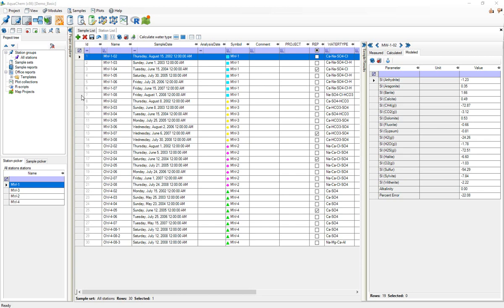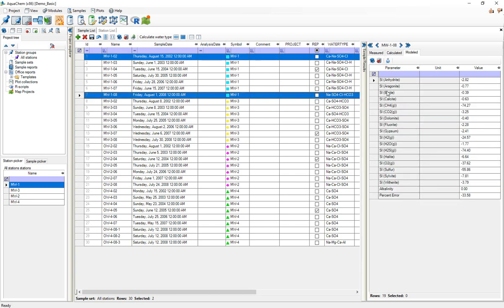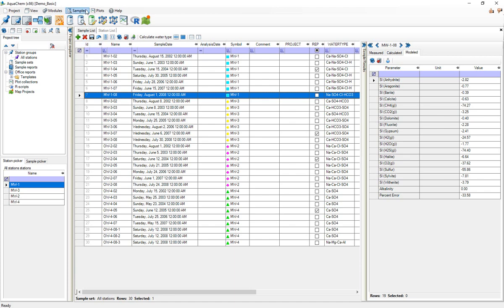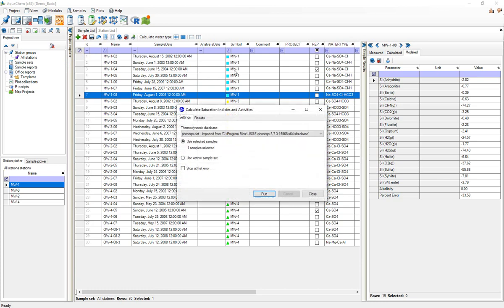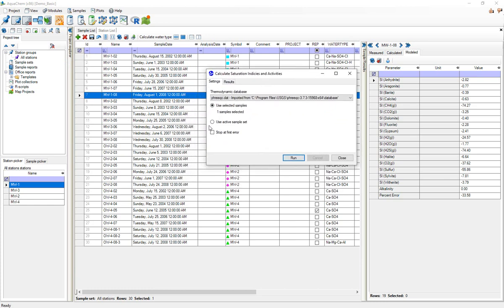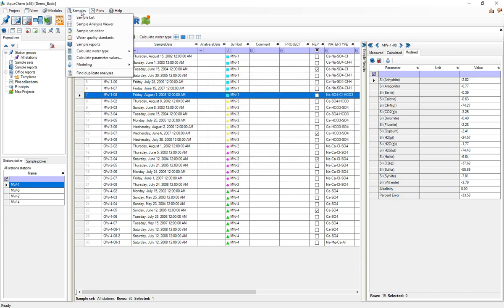There's a couple other functionalities. I just showed the one button calculation saturation indices, but if I want to do that for multiple samples at once I could do that by selecting samples, modeling, calculate saturation indices and activities, which would open this window where I could either do this for the selected samples or use it for some sample set. So if I wanted to calculate all the saturation activities or saturation indices and activities for an entire database that would be how I'd do it.